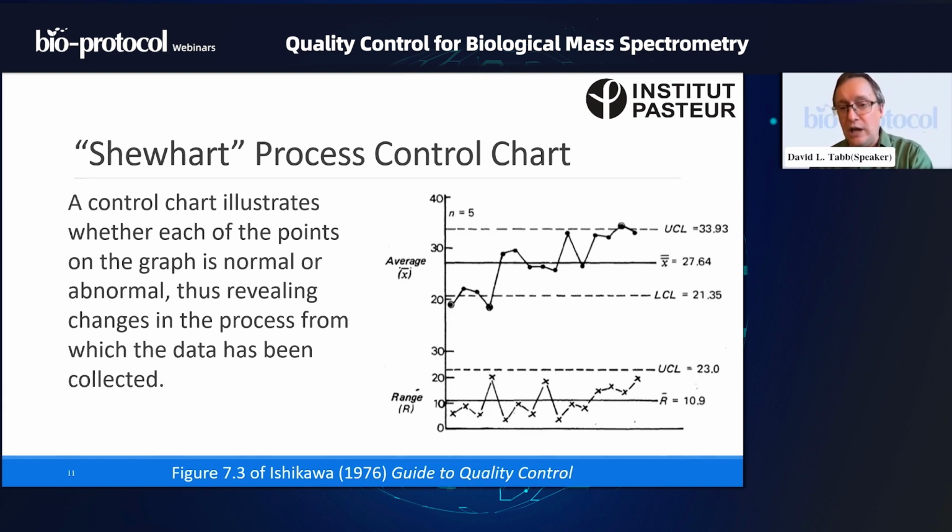So in the original process control chart shown in Ishikawa's book, we not only plot the average in the top line, but also the range, the highest value minus the lowest, in the bottom. Now you'll note that there are some values there for the average of averages at the top. That's the X with 2 bars over it, and the average of ranges. That's the R with a bar over it. Okay, so that's the typical value for the averages and the typical value for the ranges.